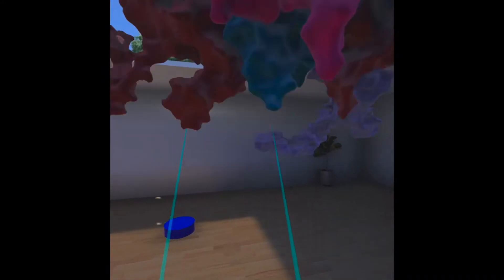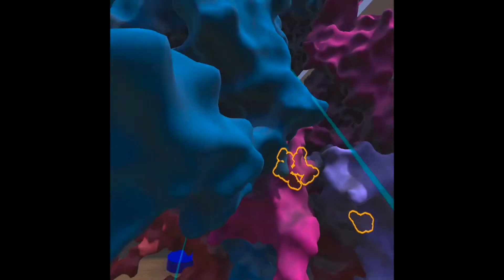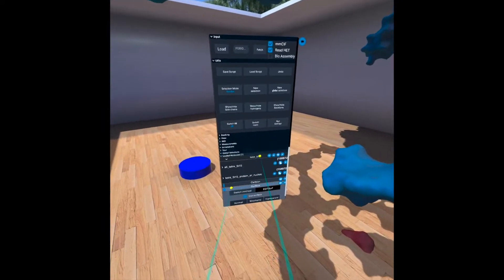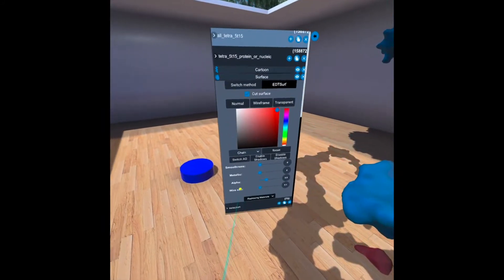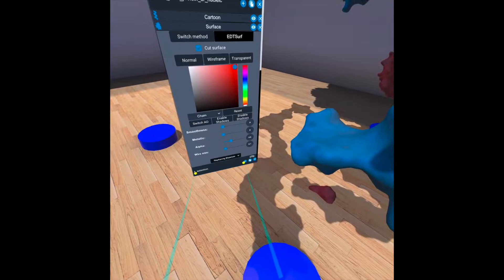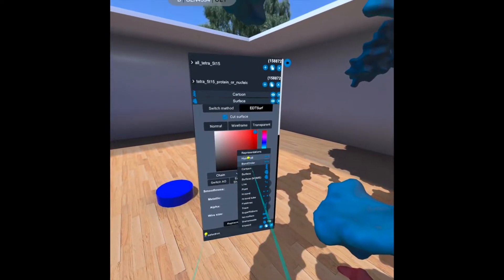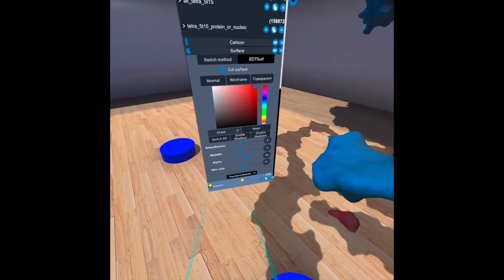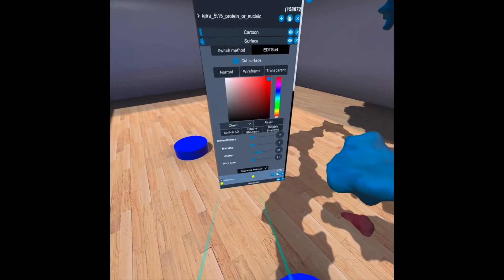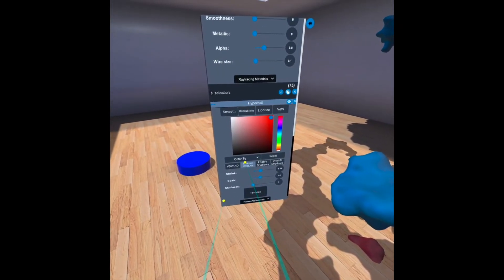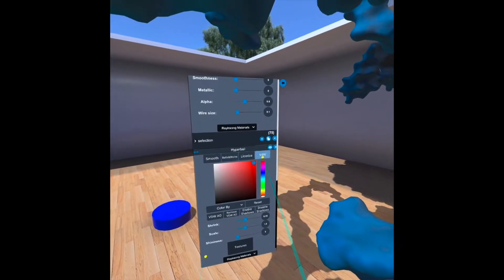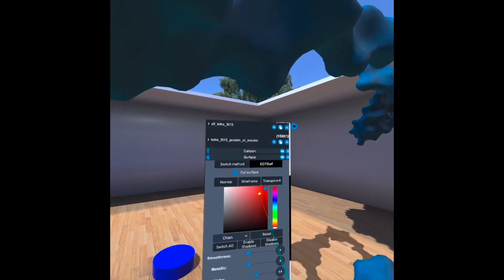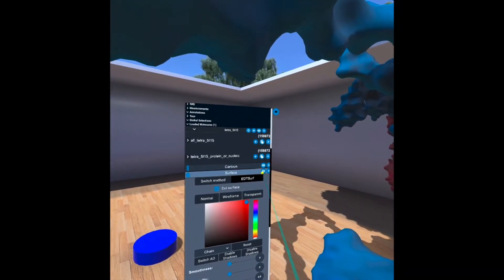And then we can zoom all out again. And we have now our selection down there. And we can add for this selection, for instance the hyperballs representation, and put it in van der Waals. And now I can remove this surface.